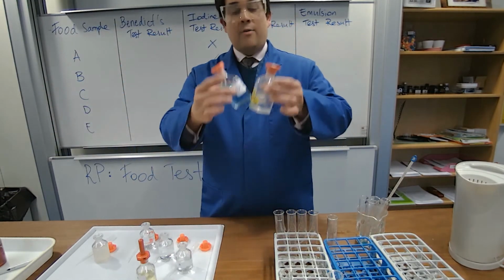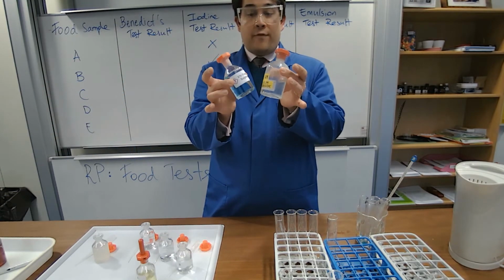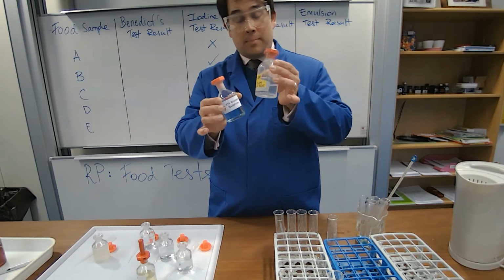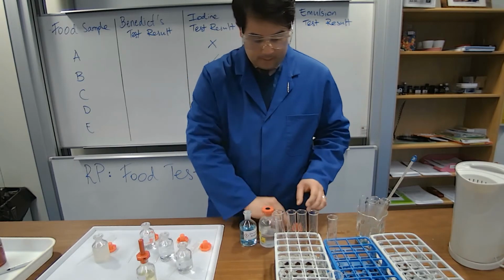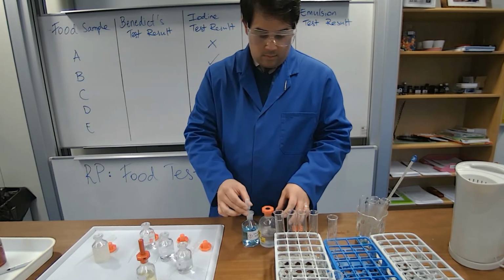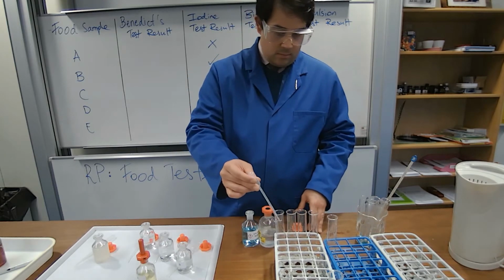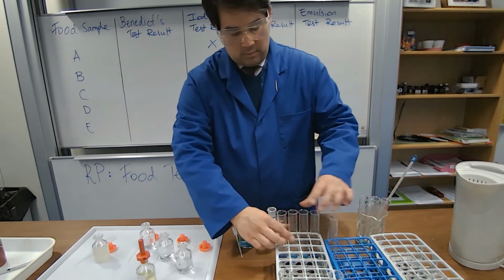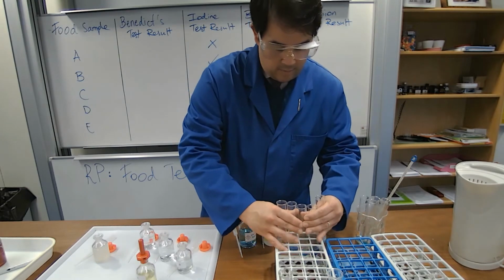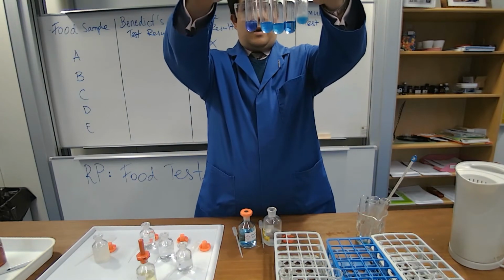We should then get a very bluish mixture. If the blue turns to lilac or purple, then we know we have a positive result. And here we have it for your very eyes. A nice clear positive result.